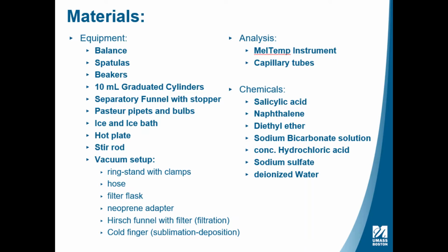When we use the vacuum setup for filtration, we will use the Hirsch funnel with filter. When we perform the sublimation, we will be instead using a cold finger. For melting point analysis, we will be using the melt-temp instrument and capillary tubes.